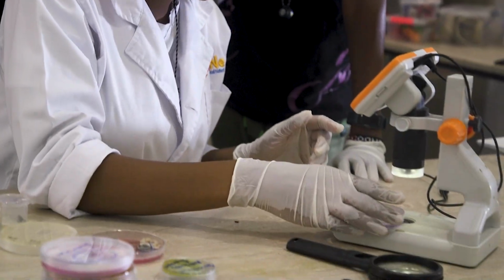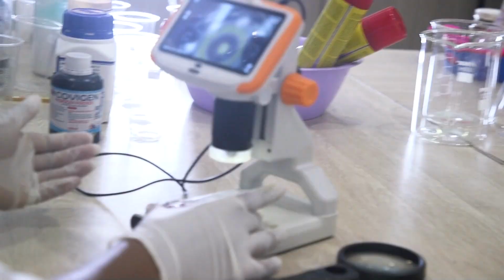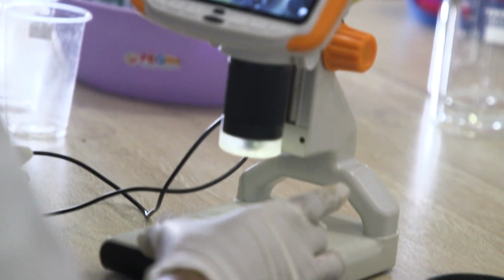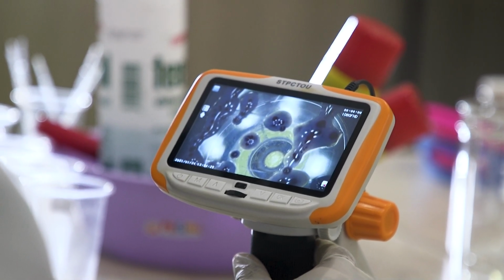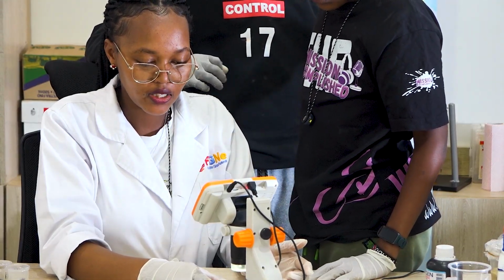We can try to see its colonies. You see there are colonies of bacteria. Let us see these colonies. There are some nice ones. We have some bacteria and fungus that are nice, some are bad to us.